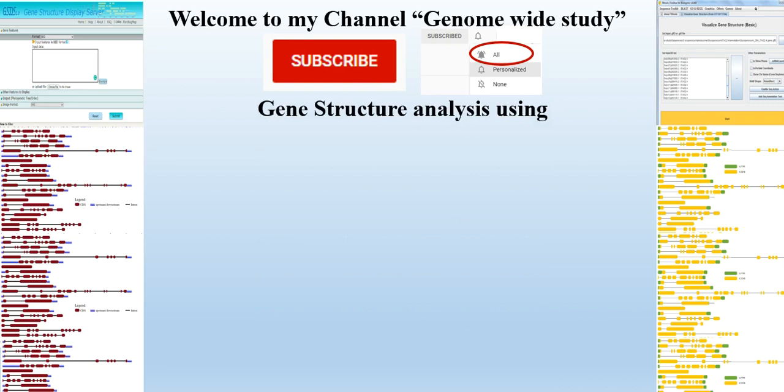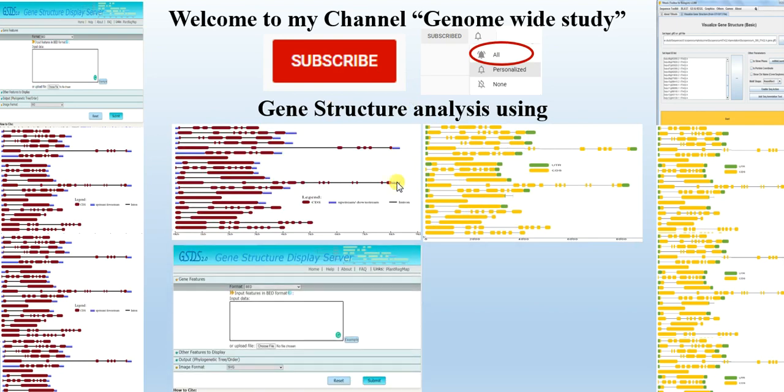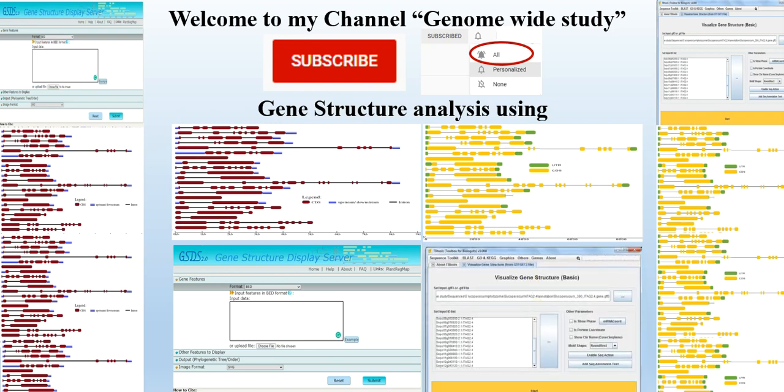In this video we will do the gene structure analysis to visualize the numbers of exons and introns and their patterns present in the genes. We will do it using two different tools: one is online, that is Gene Structure Display Server, while the other one is TB Tool. We will do it one by one in this video.